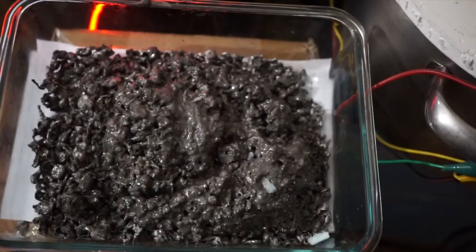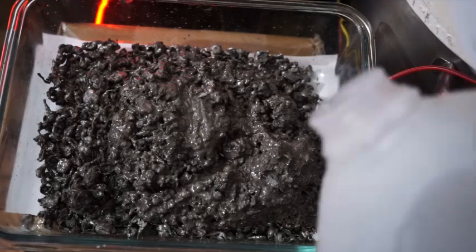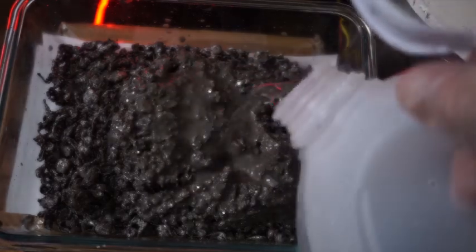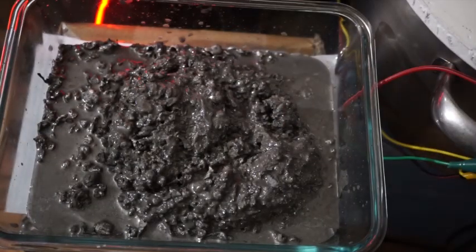There is a lot of mud in this silver shot, enough so to hinder the electrolytic process. Be sure to use only distilled water when working with silver nitrate, as the introduction of tap water will cause silver chloride to form.